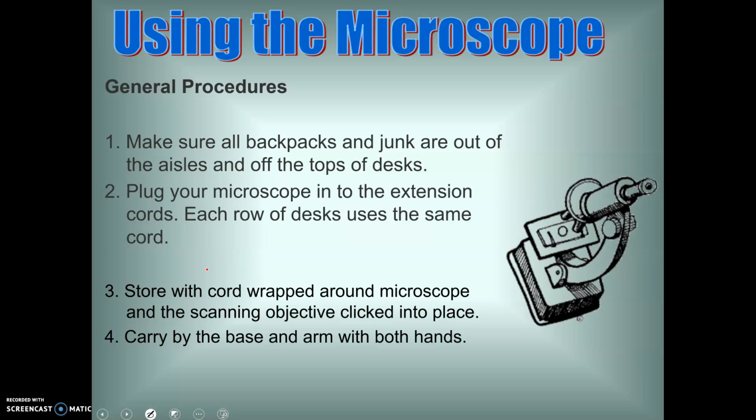Simple rules for using the microscopes. Obviously, put all of your stuff out of the way. It says to use extension cords.